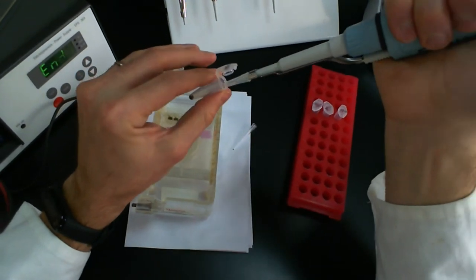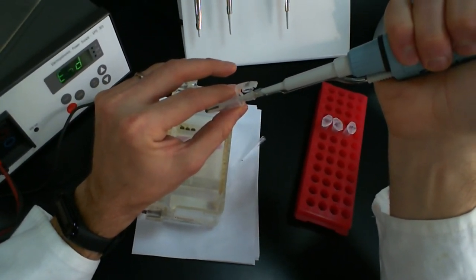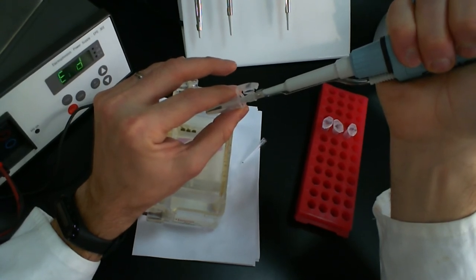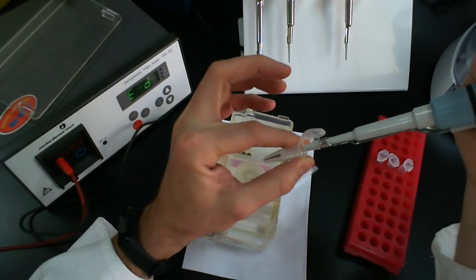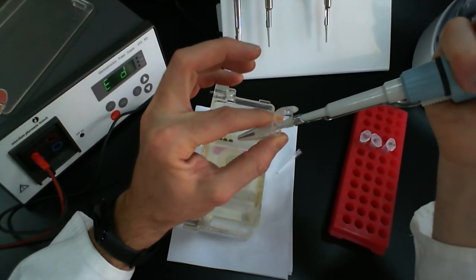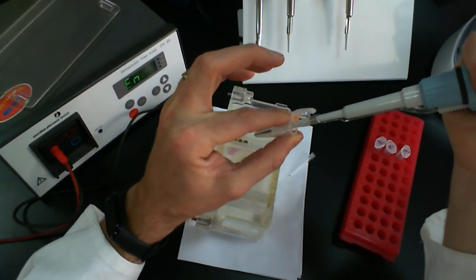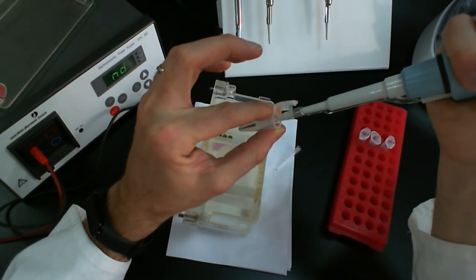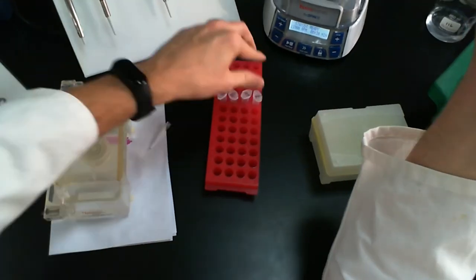Again, last sample. I'm going to mix it really quickly and take up my 25 microliters. Again, be patient. Don't press too hard. If you press too hard into the bottom of your epitube, you're going to block the actual opening to your micropipette tip. And so you want to just gently press down to the bottom and really take up all the liquid from the bottom. Okay? And again, last one.